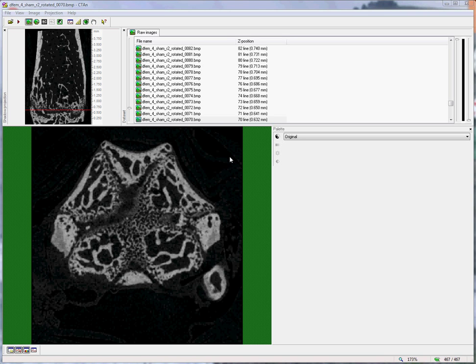Hello. This video shows how to set a region of interest for the analysis of trabecular bone in a mouse distal femur.